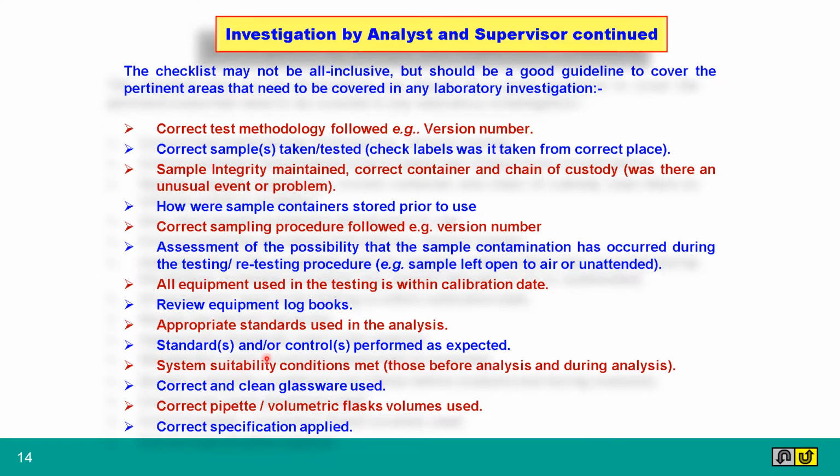Standard and / or control performed as expected. System suitability conditions met, those before analysis and during analysis. Correct and clean glassware used. Correct pipette / volumetric flasks volumes used. Correct specification applied.